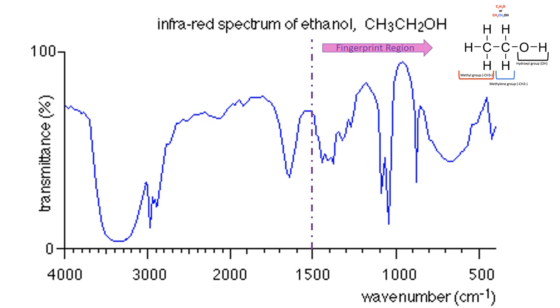So I want to focus on a few things. It's an alcohol, so we're going to be looking at the OH group. I've highlighted them both in green, so where it is on the molecule and where it is on the spectrum. Now the OH has two bands, you might notice in your reference sheets, and the location of where the OH is absorbed depends on whether it's an alcohol or an acid.